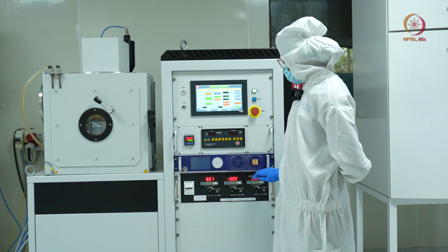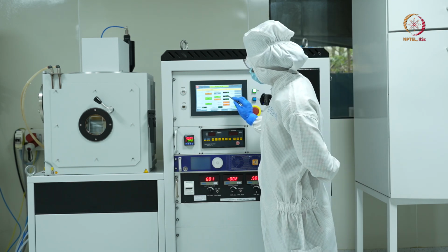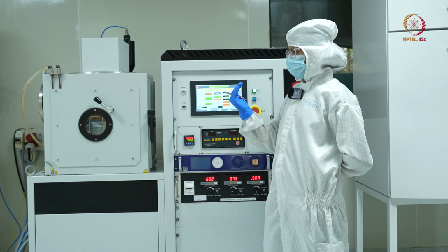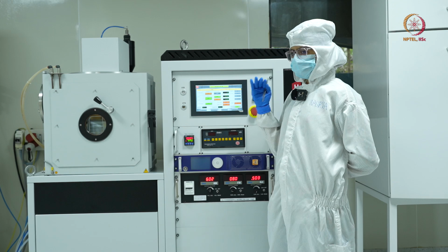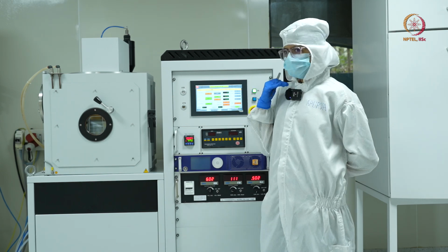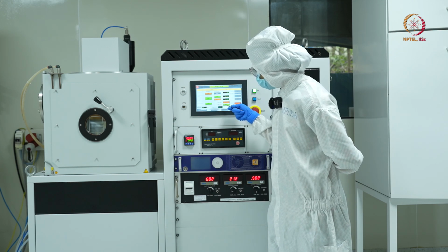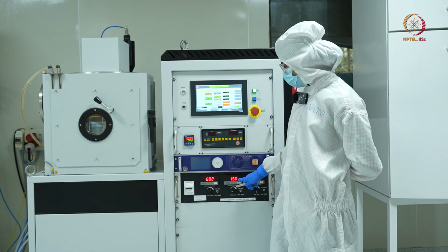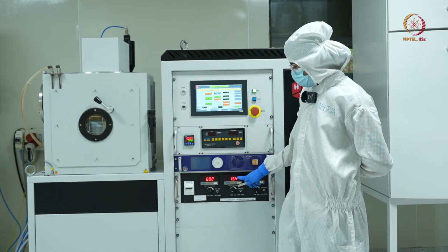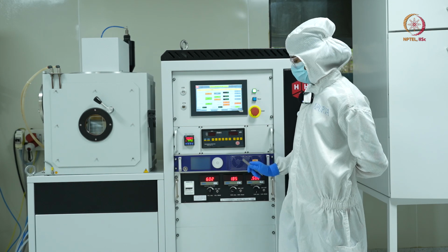Now as you can see, my current is 0.5 amperes and my argon flow is 12. So maybe the argon atoms near the target are not sufficient. So what I'll do, I'll just open and close the shutter. Now as you can see, suddenly from 0 to 148, 150 the power has increased. That means plasma has struck.